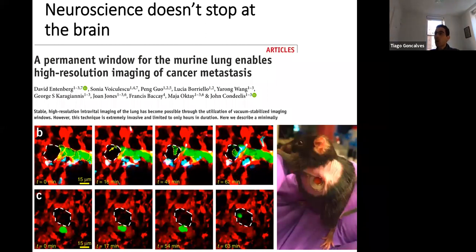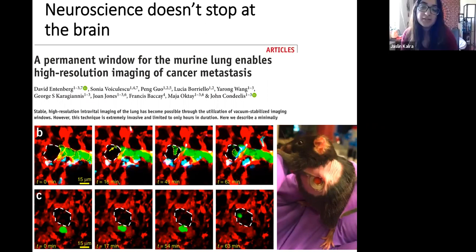So there are drawbacks sometimes, and there's stuff like that you need to control for. It will depend on what area of the brain you're imaging, and on whether that's important for the behavior you're studying. But you're putting something into the brain. The same goes for putting an electrode into the brain, right? I don't think I have anything really smart to say about that, other than just do the controls. You need to do the controls for your particular application, your particular behavior paradigm.